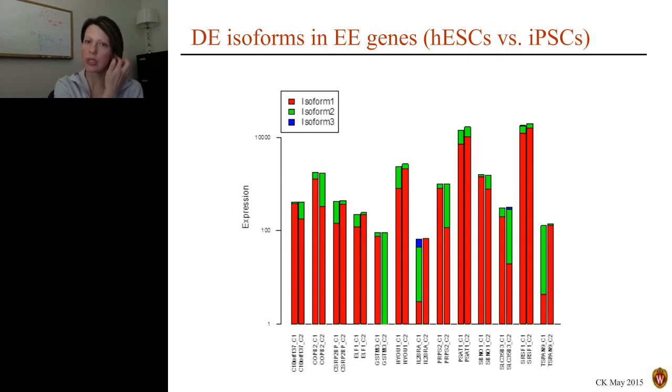So here's a number of pairs where we find, I'm showing you these are genes with 3 isoforms, and we can see in the 2 conditions, we'll take one here that's very obvious, this one right here. We can see that gene expression looks very similar. This is expression on the y-axis. The gene expression levels look very similar, but the isoform expression levels are different.